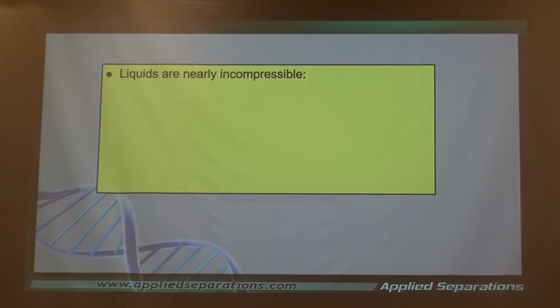Let me give you another example. I give a lot of talks to non-scientists to try to explain the technology. One of the things that I use to explain phases is that if we were all in this room and we all now hugged each other very, very closely, we would be molecules that would make a solid. If we now dispersed, and there were only three or four of us in the room and we were in the far corners of the room, we would be very, very far apart from each other, and this would be like a gas. Now, if I throw a ball into the cluster of people, it's not going to be held there, it's not going to be dissolved. If I do the same thing with a gas and throw it into the middle, it's going to hit the floor, it will not be retained either, because the people, the molecules, are too far apart.